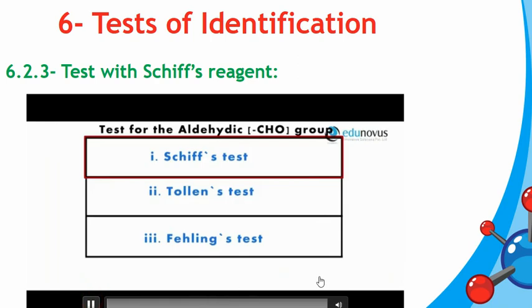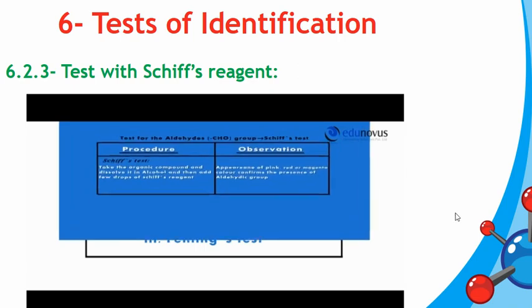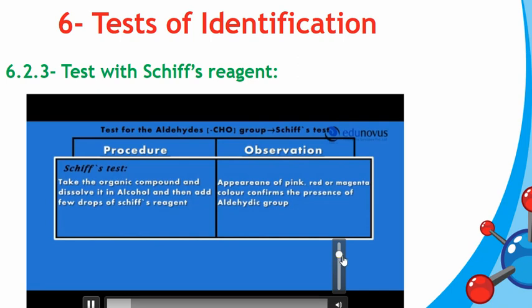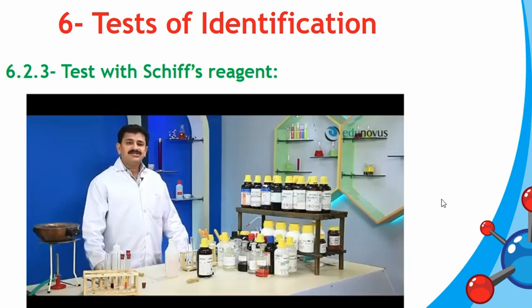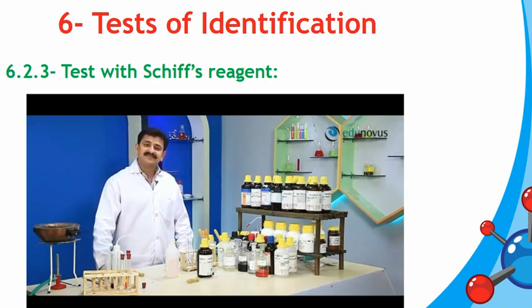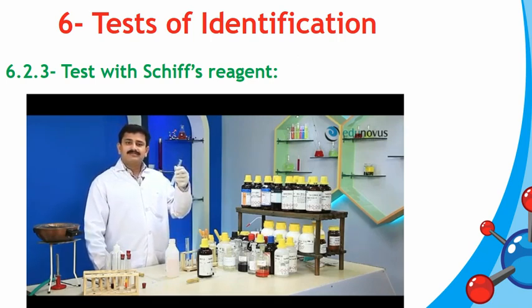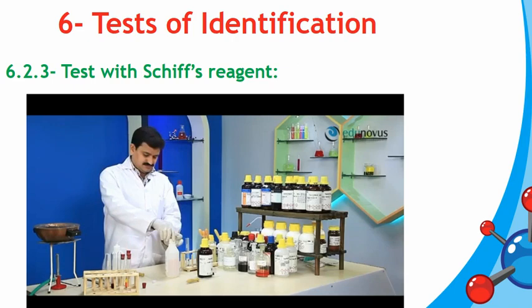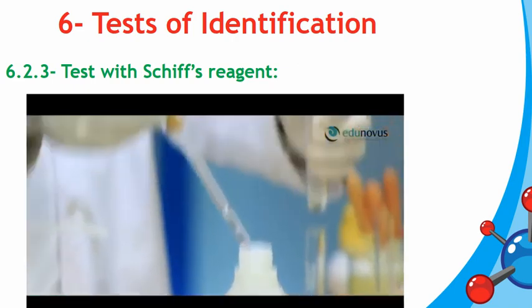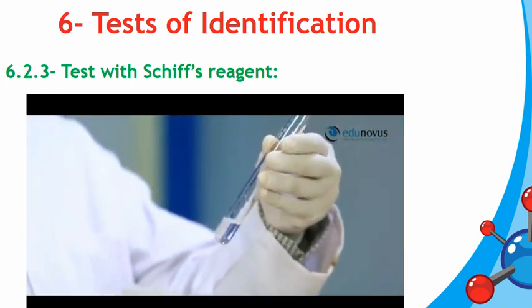This video shows this test. This is the colorless organic compound.